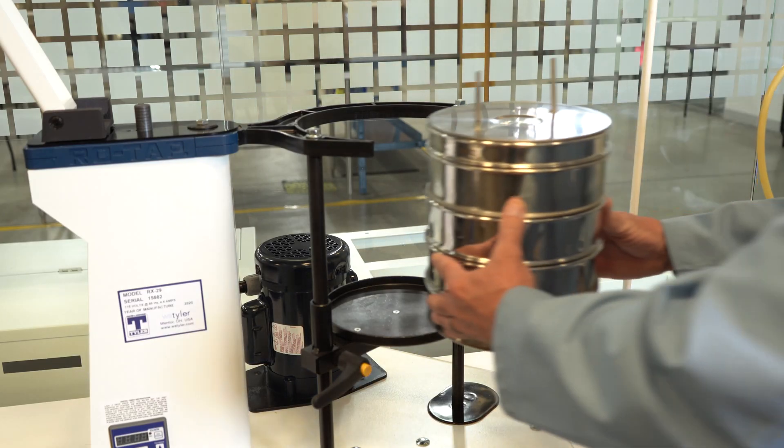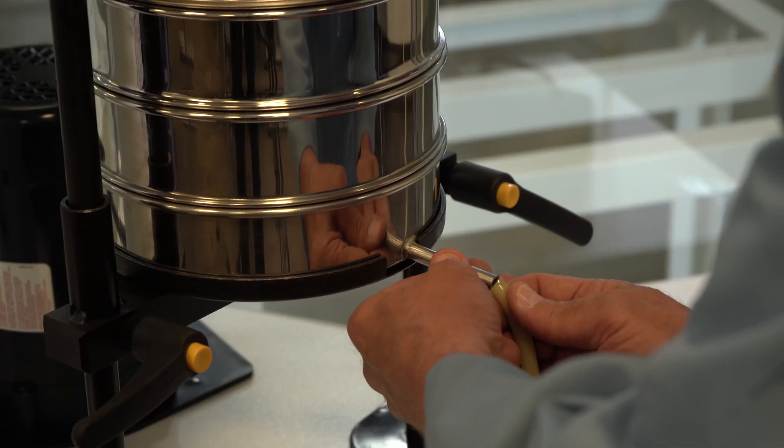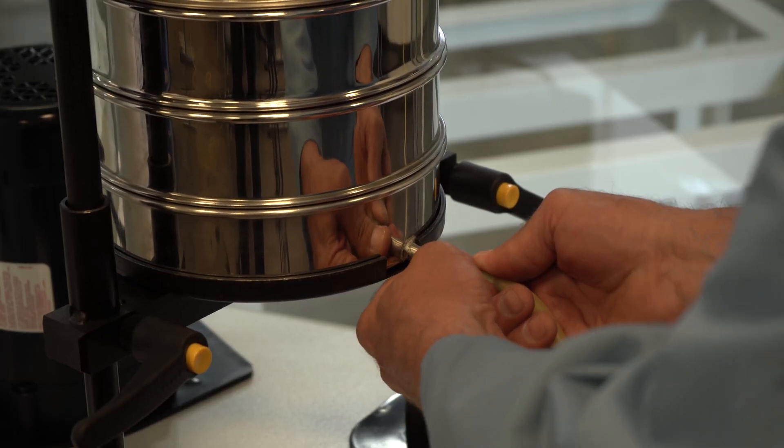Step eight: place the sieve stack in the shaker on top of the bottom pan. Attach the outlet tube to the steel tube on the bottom pan.